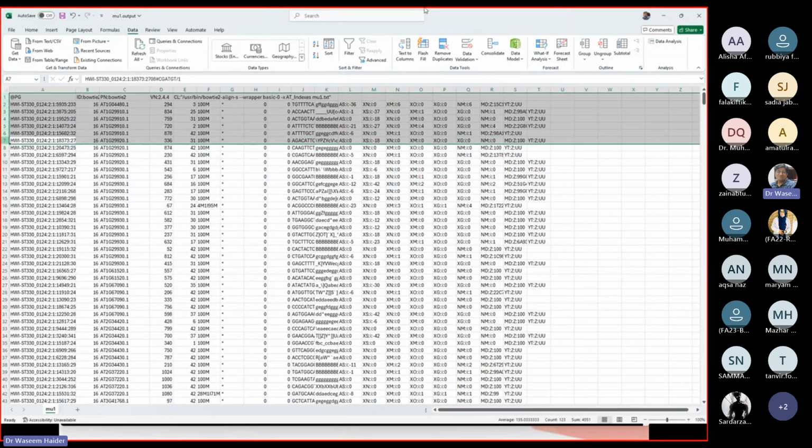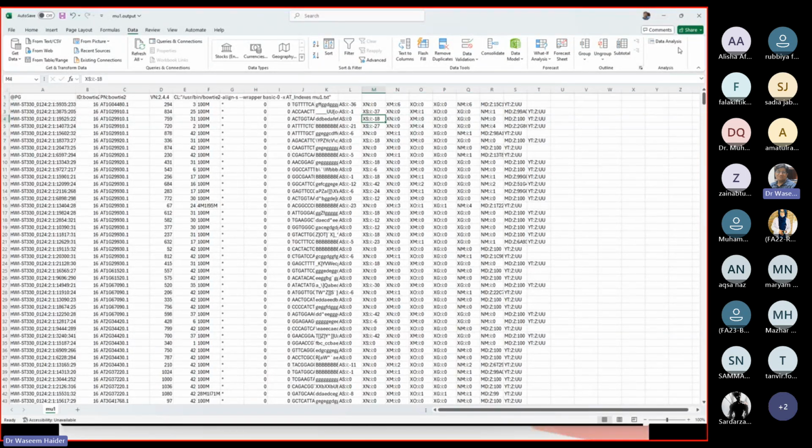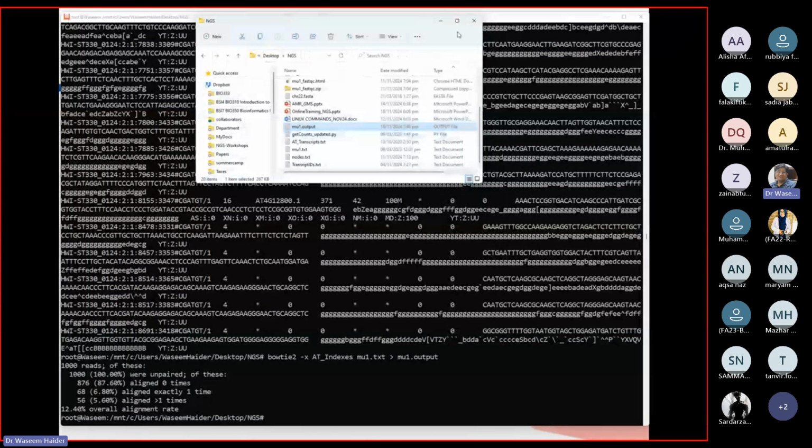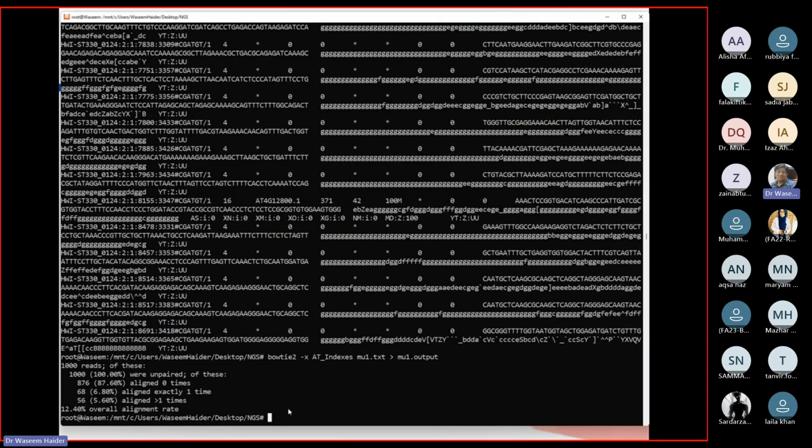We can check that, but we are not doing this quantification or counting here. For the rest of the flags, you can just Google, go to Bowtie2, and it can tell you what the rest of these digits indicate. Okay, all right. So last but not least, Control L.